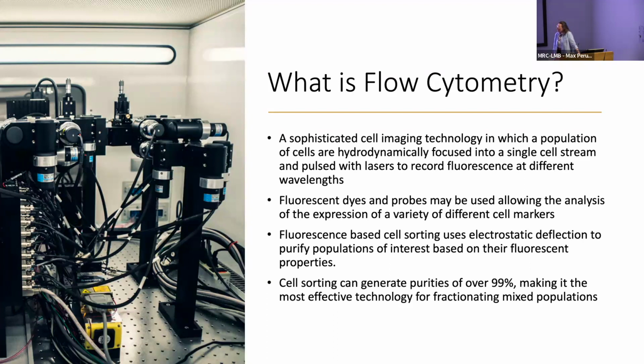I like to use the analogy of if microscopy were like the long distance runners, these would be the sprinters. So it's very, very quantitative. And when I say quantitative, for certain types of cells, we can do up to 25,000 events per second, which is pretty mind-boggling when you think about it.